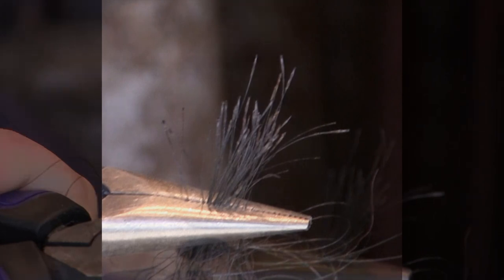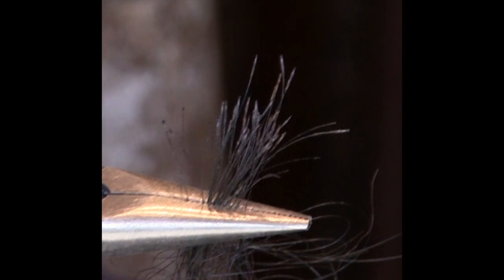Do not cut the hair from the animal, as the roots must be present for DNA analysis. Pull enough hair such that your sample is about the size of a pencil, which is approximately 30 hairs.